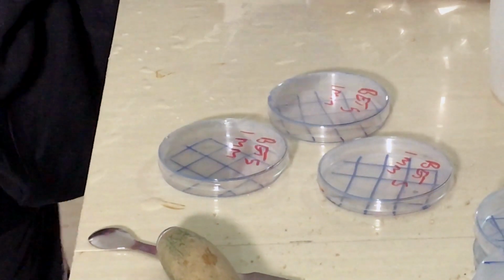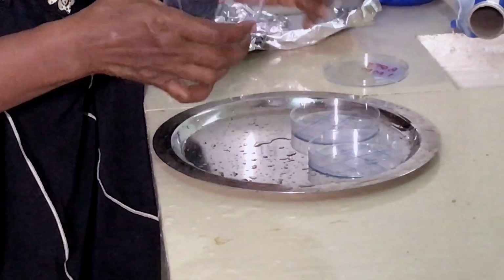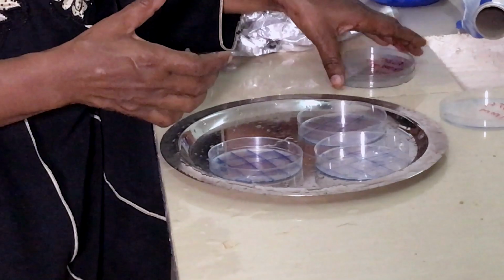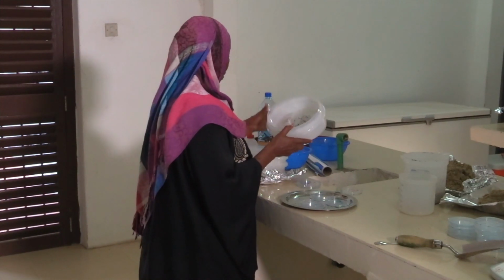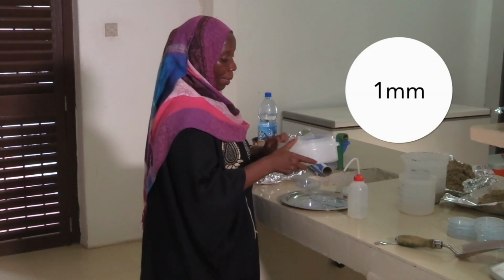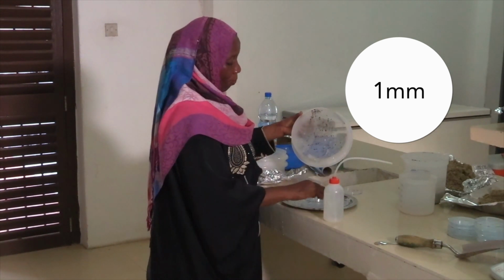So now we start the separation of our microplastic or possible plastic. We use only 3 petri dishes, I think enough for a sample. And I take the top one, which is the 1 millimeter sieve plate.